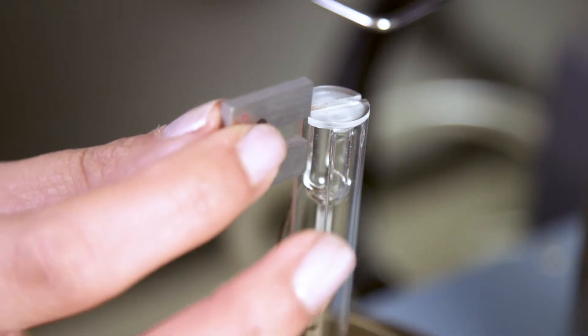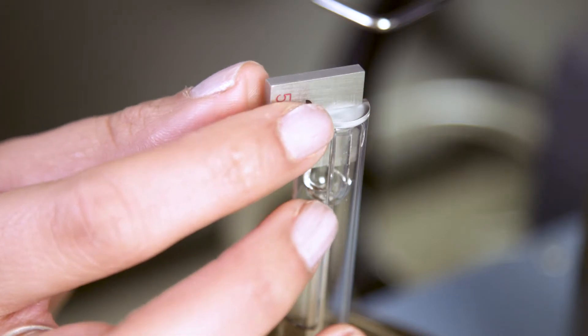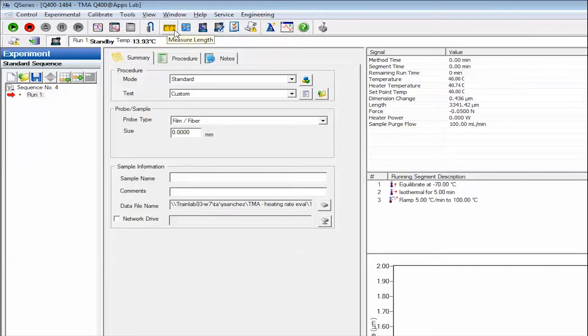Slide the calibration fixture around stage and prop. Press the Measure Length key on the toolbar. Record this value as the display size.